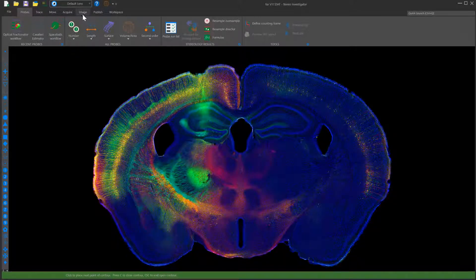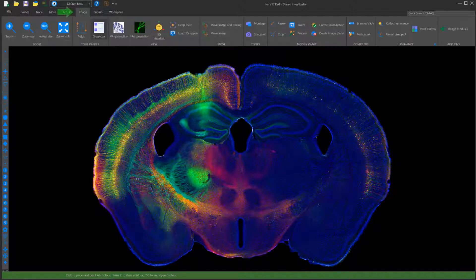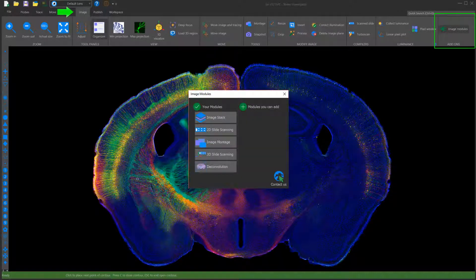It's also easier to find the imaging modules on your StereoInvestigator system. In the Image tab, simply click on Image Modules.